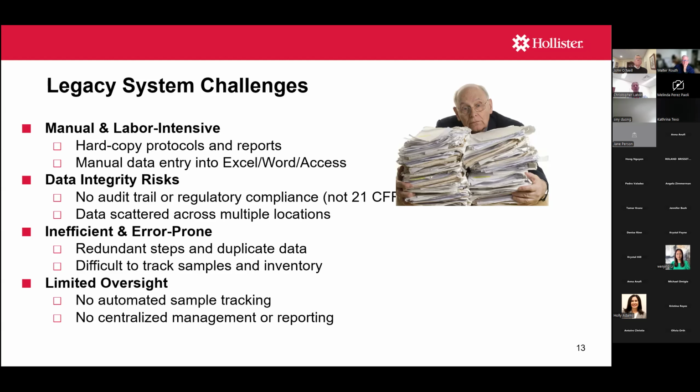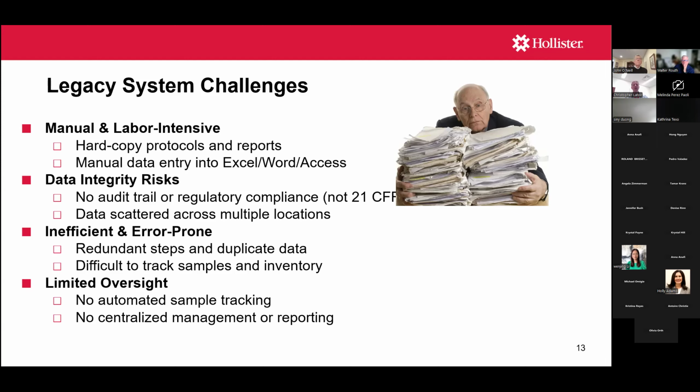And in many cases, we'd have data scattered across multiple locations. Sometimes a technician would have a spreadsheet stored locally on their computer, and they would forget to upload that information to the network drive. So that was problematic. It was inefficient and error prone. Sometimes we would actually duplicate studies that we had done previously just because we could not find the data, or perhaps time intervals were skipped, those types of things.